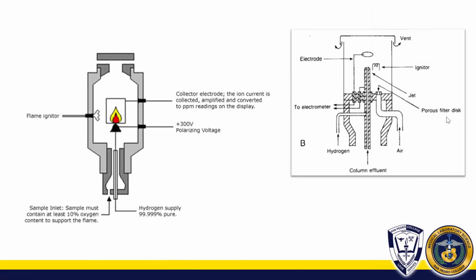Now we proceed with your FID, your flame ionization detector, which was presented a while ago in the video on how your gas chromatography works. Here you can actually see the literal flame.